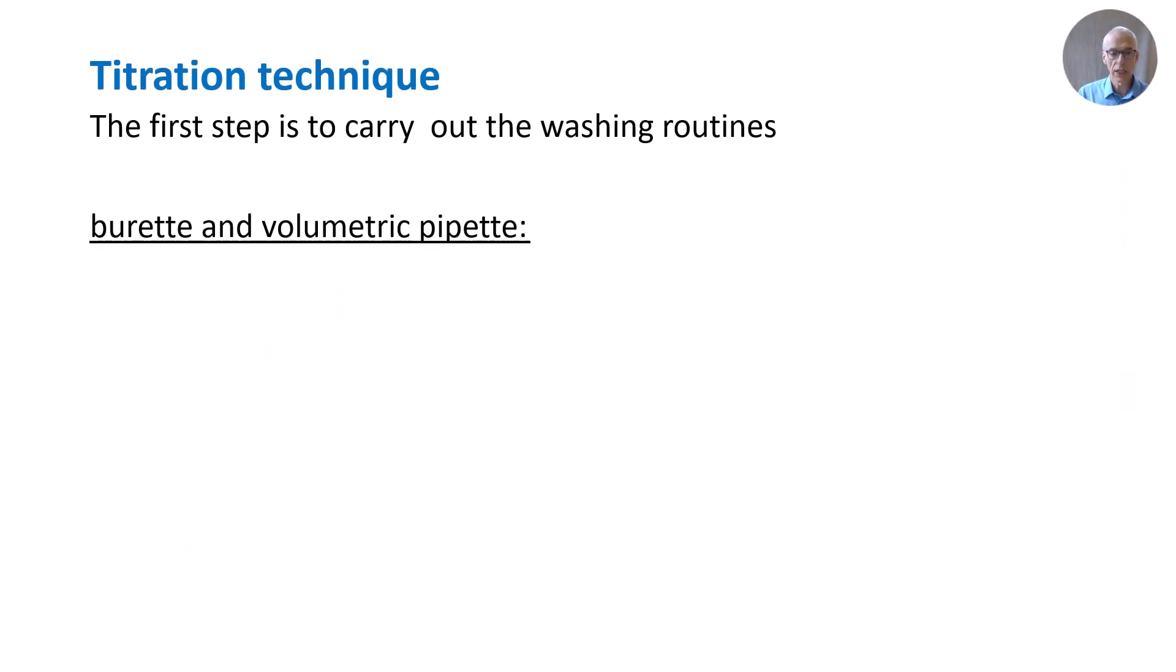Let's get into some titration technique. The first step is to carry out the washing routines. For the burette and volumetric pipette, the first thing to do is to rinse with distilled water to remove impurities.